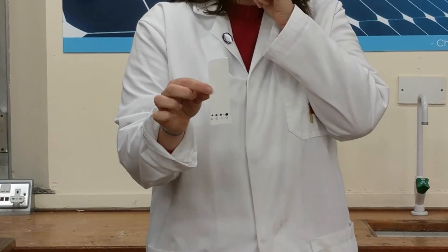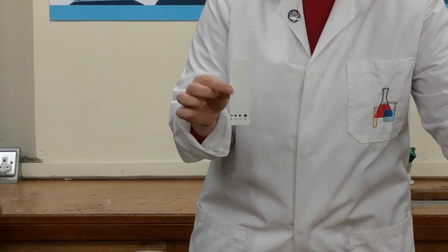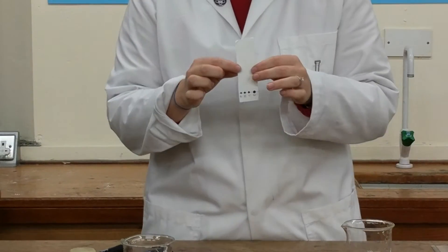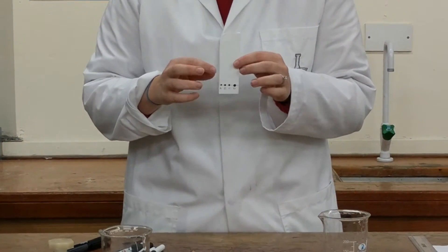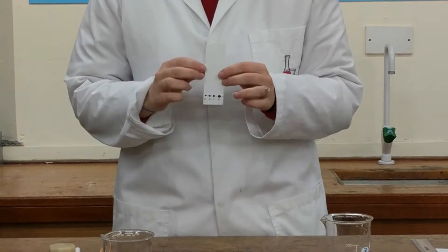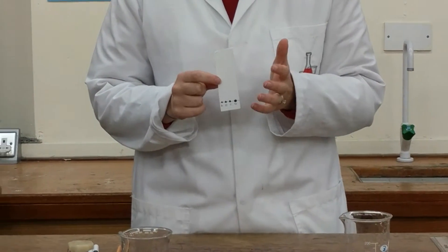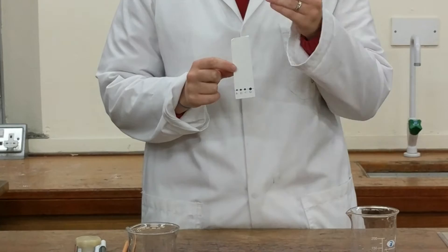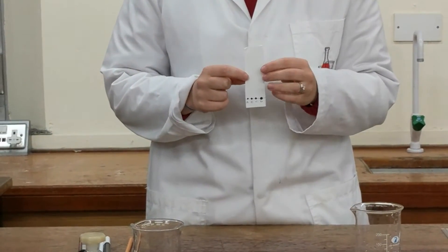Now this is ready to go into one of our solvents. These inks are going to separate into their different components, because they are made of a number of different components. Each of them have a different solubility, so they will travel up the paper by different amounts.